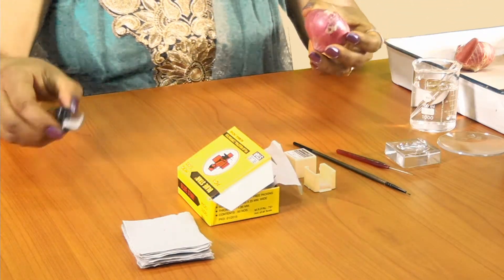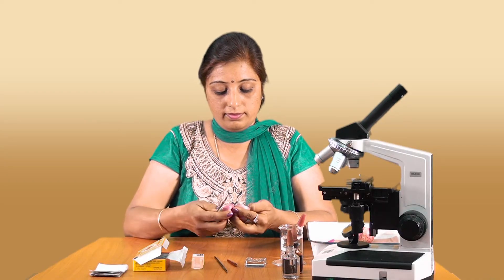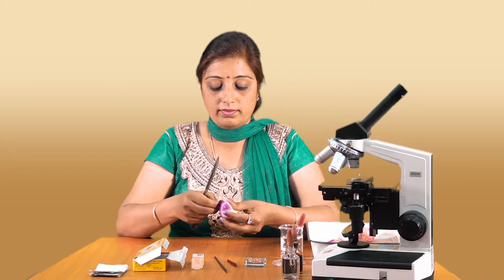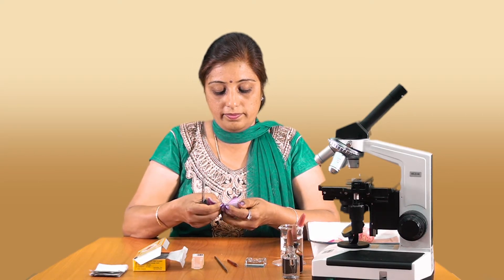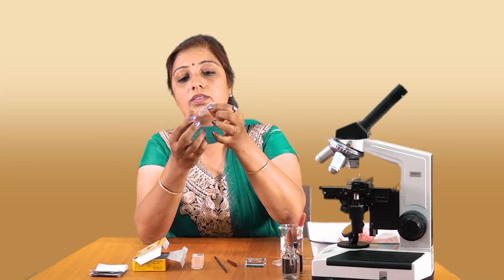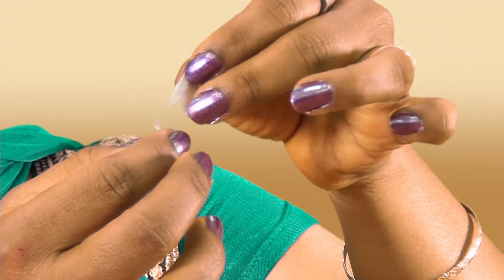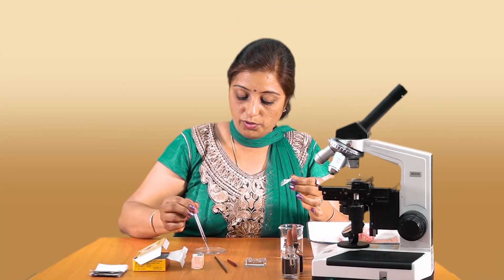First, I am going to cut the onion and take a part of it. This is the material or the peel I was looking for. You can see this peel — it is one layer in thickness. Put it in a few drops of water.